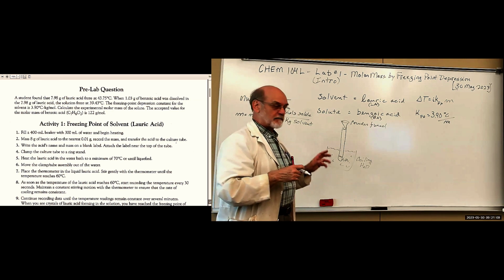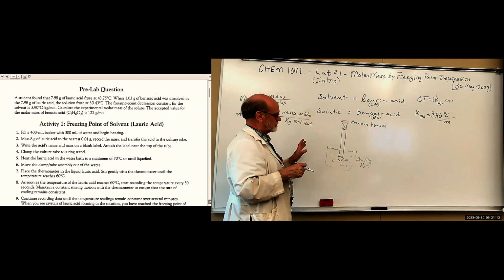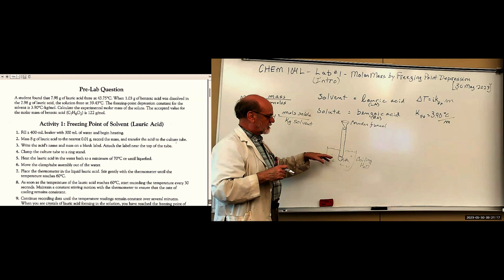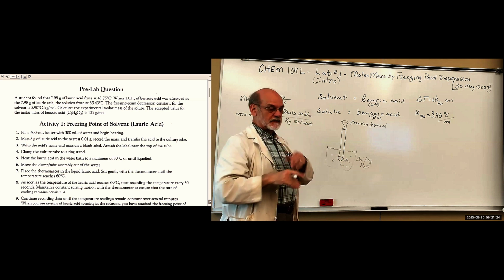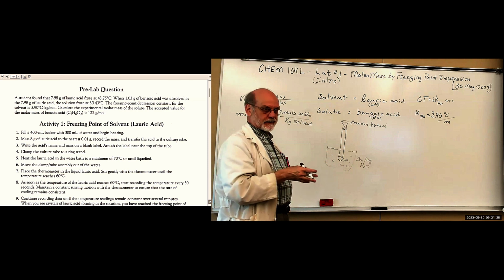Okay, so rather than determining the melting point as it melts, we're going to determine the melting point as it refreezes. And those two temperatures are the same. The temperature of melting and the temperature of fusion are the same.